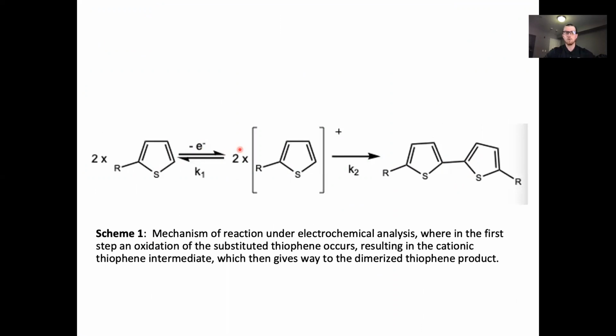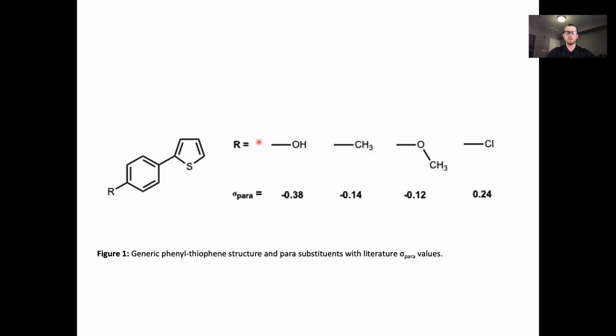Now, as I've mentioned before, we are going to be doing this via cyclic voltammetry. Cyclic voltammetry is used for many applications in electrochemistry. More importantly, it is used to investigate oxidative and reductive mechanisms of chemical and molecular species. In order to do this, we also compared cyclic voltammetry to a biologic software simulation that allows us to compare the experimental data versus a simulation of that same data to give us more of an accurate reading on things.